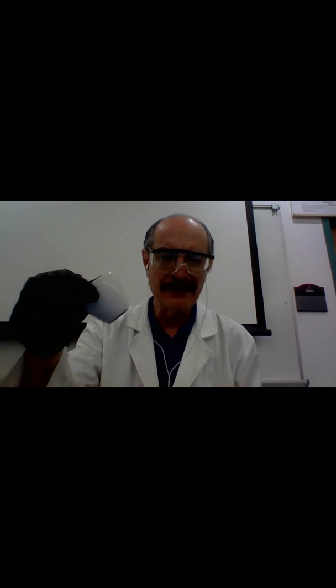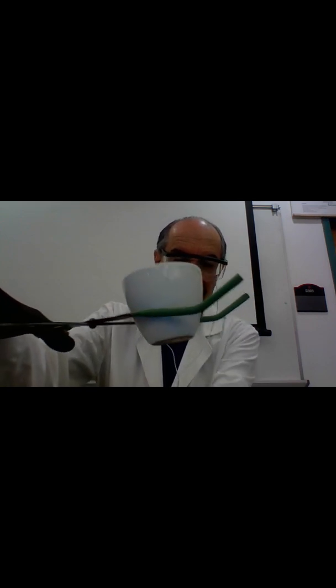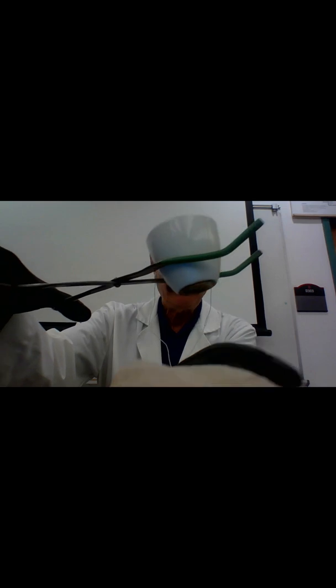Let's talk about the proper handling of your crucible. When you receive it from the stock room, you don't want to get your fingerprints or skin oils on the surface, so we're going to use crucible tongs. Notice the tongs have pointy ends for the lid, and a curved section that makes a scoop to hold the crucible. Always have a piece of paper towel underneath in case it slips so you don't drop it on the floor.